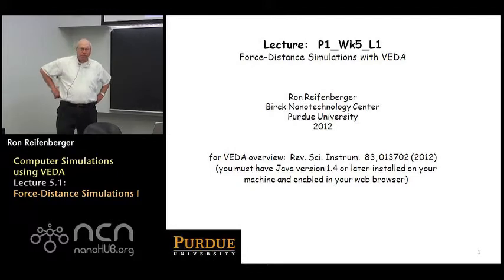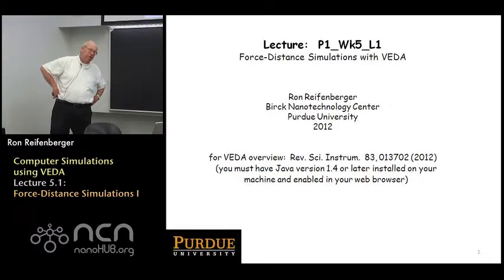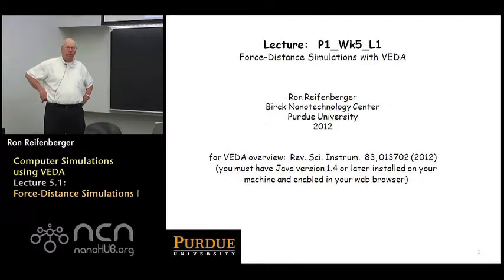Hi, we're back again for week 5 of this course called Fundamentals of Atomic Force Microscopy. This is part 1 of the course, and this will be the final week of lectures for part 1. In week 5, we're going to focus largely on performing numerical simulations of many of the ideas that we've already discussed in the first 4 weeks of the semester.